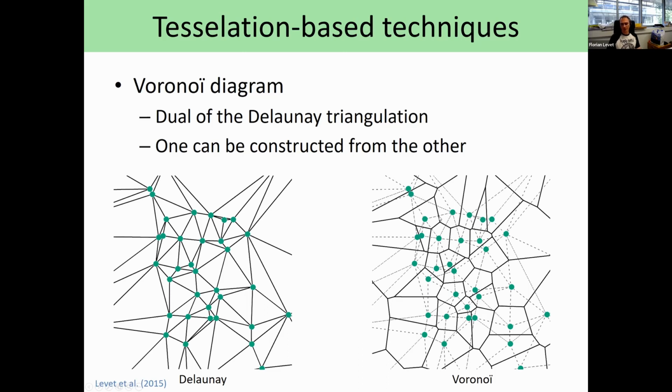Obviously, the algorithm is a little more difficult than that, but you can see that, for instance, this one is a bisectrix of this triangle edge. When you do that, you end up with this space subdividing technique, where any point in the space that is inside this polygon is closer to this localization than to any other localization.